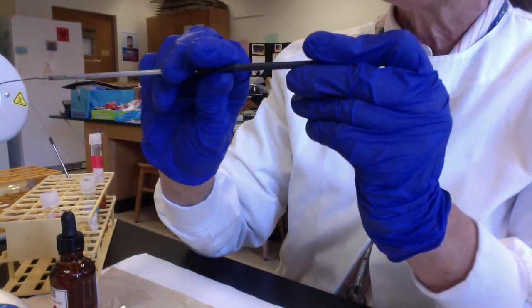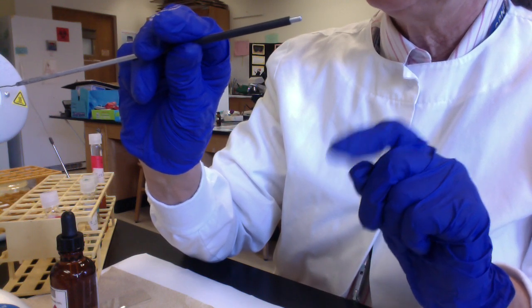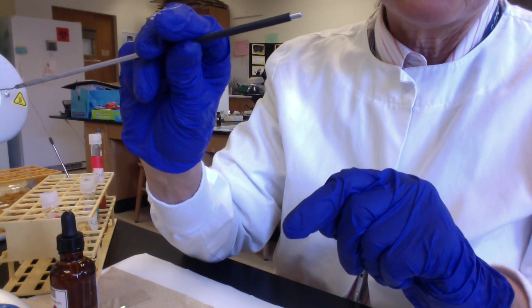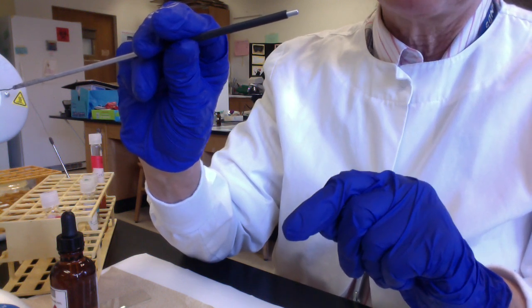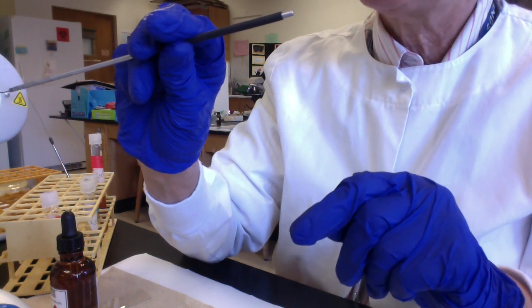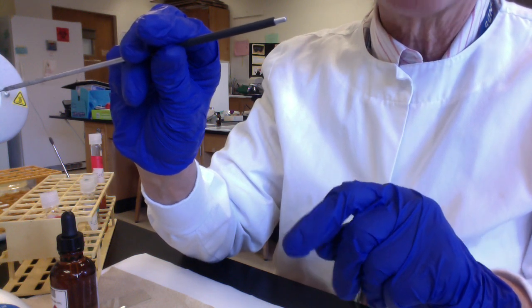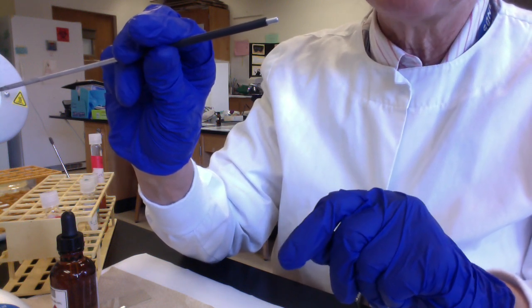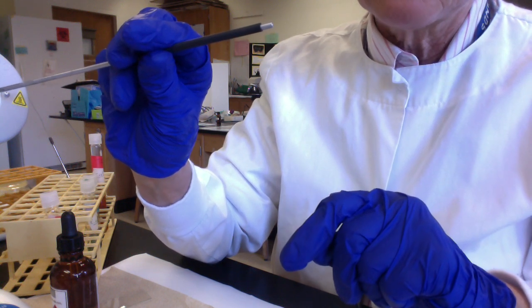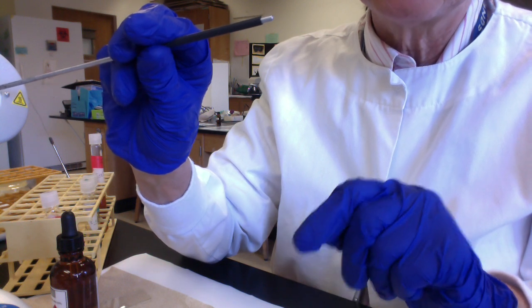So, folks, we're going to let our microbes grow for 48 hours. And then this weekend when we come in, we'll do a movie. I'm going to add the pH indicator methyl red. And the reason we can't add methyl red ahead of time is it would kill the bacteria, and we have to have them grow and ferment before we can run the test. So methyl red will turn red at really low pH, below pH 4.4, 4.5. So if our microbe carries out mixed acid fermentation, we add the methyl red pH indicator, it should turn red.